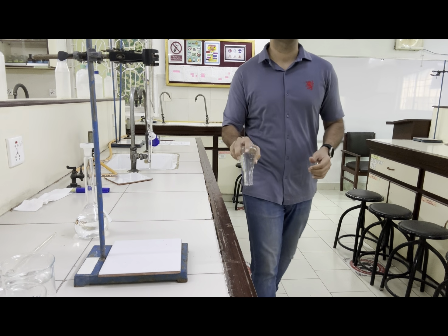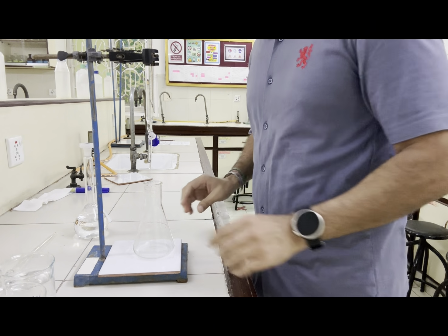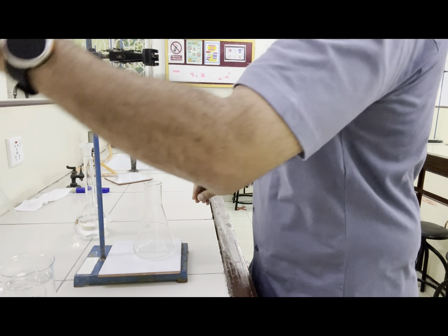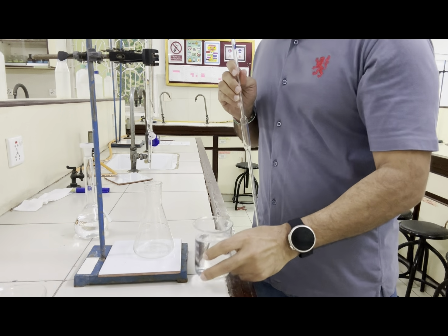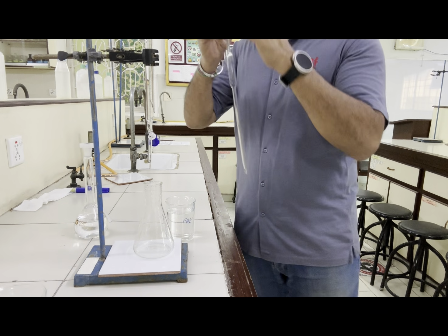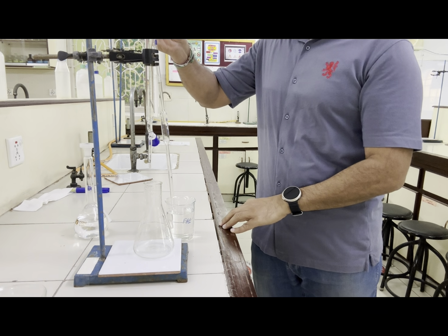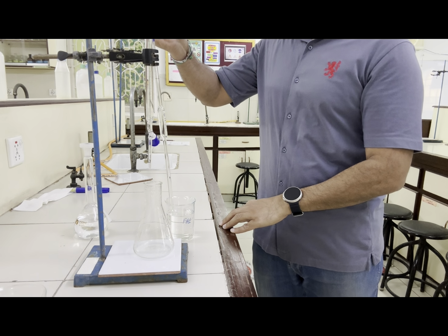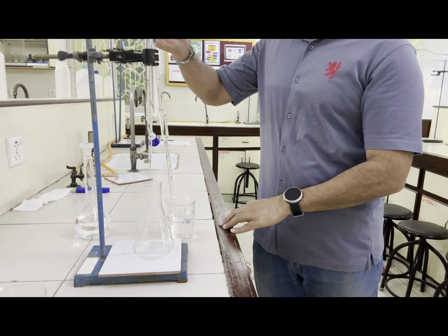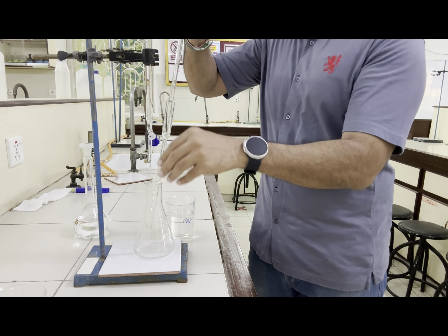Dry as much as you can, and then using the pipette, take out Fa1, 25 centimeter cube. Remember, use the same pipette you have used the previous time, because two pipettes are given, so students get confused. So this is 25 centimeter cube exactly, transferred into the conical flask.